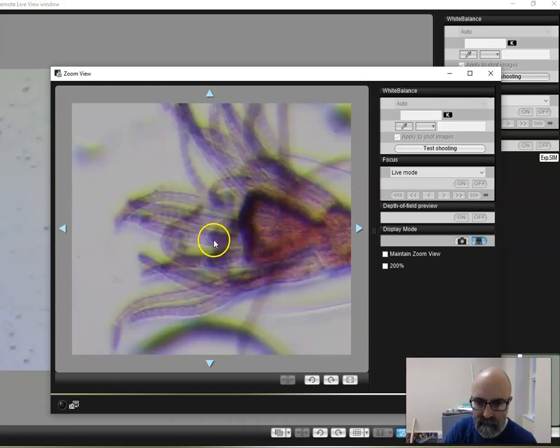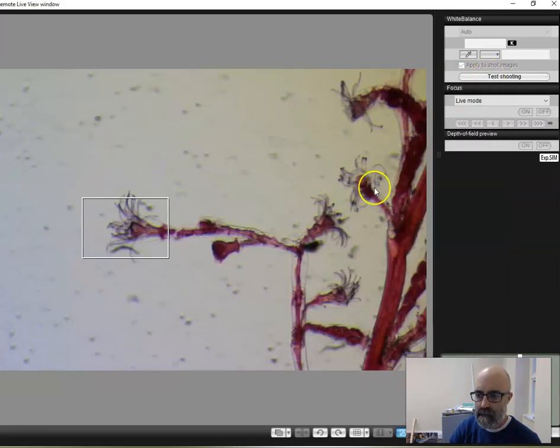Here's the tentacles covered with the stinging cnidocytes. You can barely see those in this highly magnified situation. This would be the gastrovascular cavity, and the mouth would be here. Okay, so there is just one opening to these cnidarians. They don't have a complete digestive system, so they ingest, digest, and excrete here, and there are the tentacles. Okay, let's see.